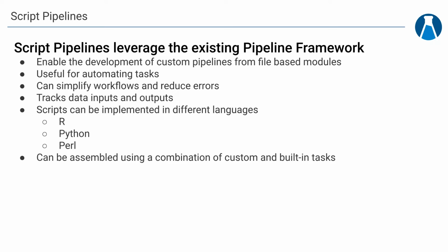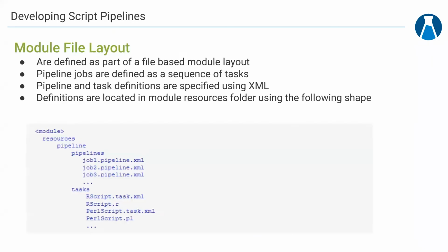Using the pipelines can simplify the workflows, help reduce errors, and provide some consistency. We can provide inputs and outputs, and we can use different scripting languages to allow some flexibility on what you're comfortable with, and generally make it easier to use. So let's talk about what they actually look like and how we actually develop these.